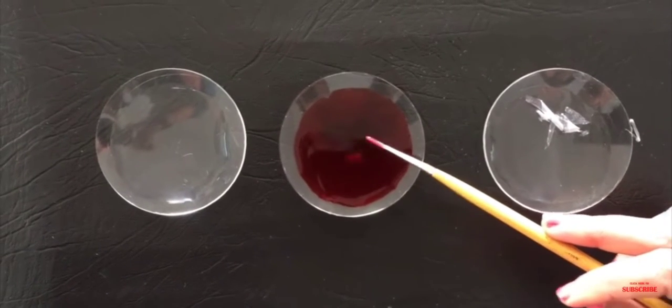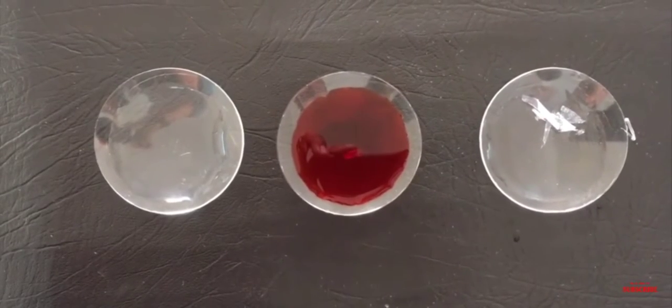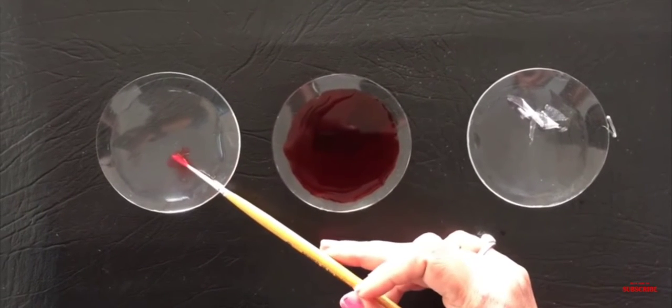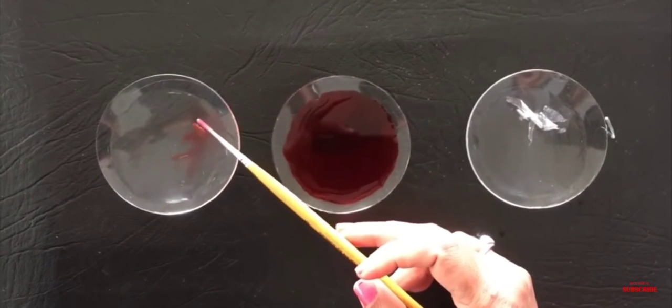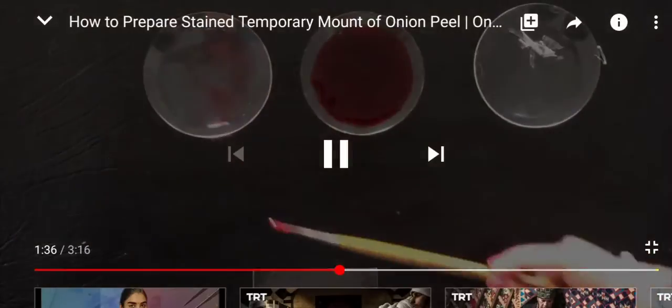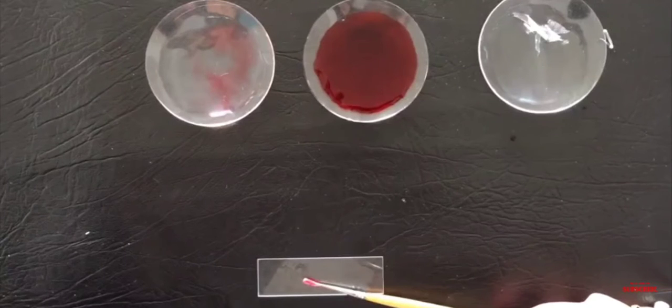For the fourth activity you have to place it in the watch glass which has the stain. So safranin stain, or more preferably methylene blue stain, can be used. Dip it for 2 seconds and then take the onion peel cell and place it in the third watch glass which has glycerin. What is the speciality of using glycerin? This is a very soft tissue. It will easily get dehydrated. In order to avoid the dehydration, moisture has to be kept, and that will be provided with the help of this glycerin.